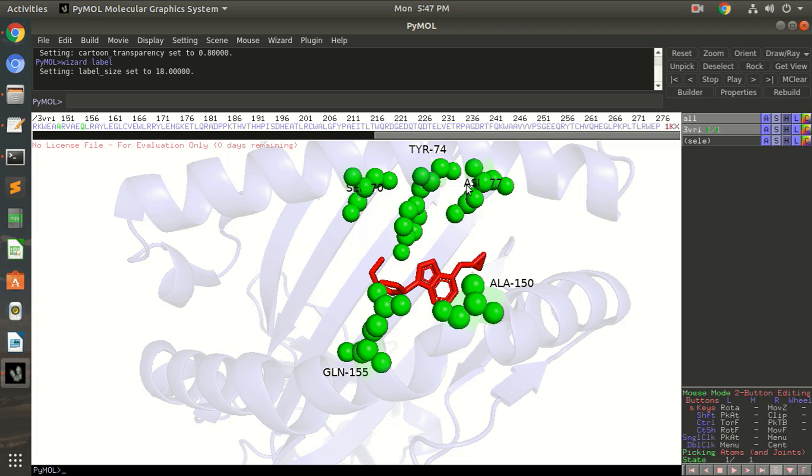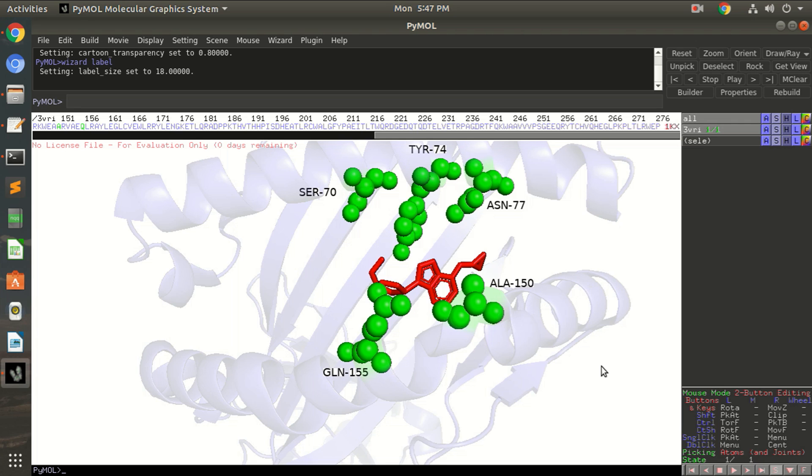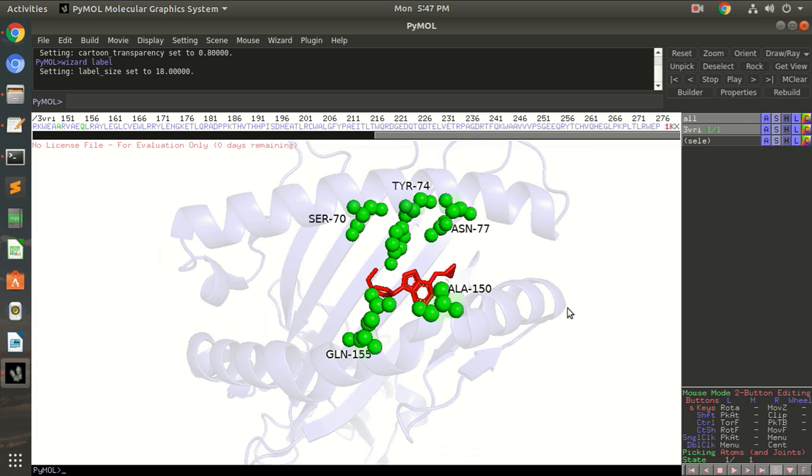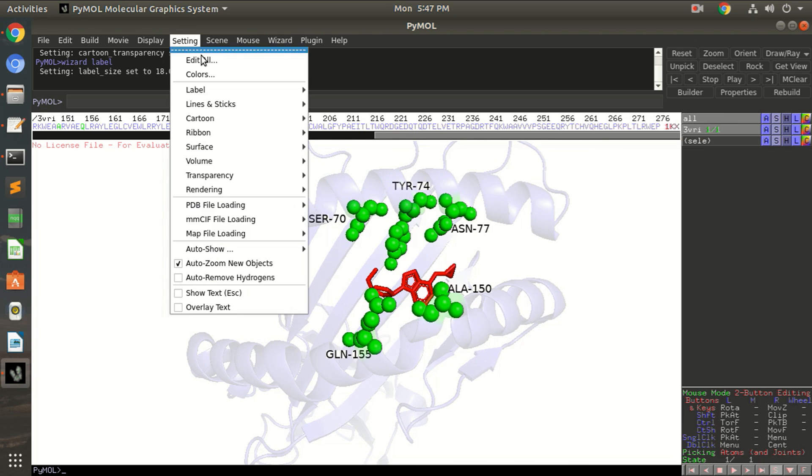See, now you can see all the residue names. All right, so they are clearly visible.